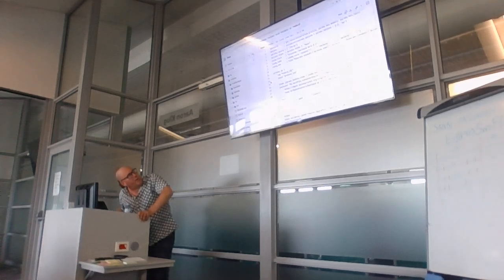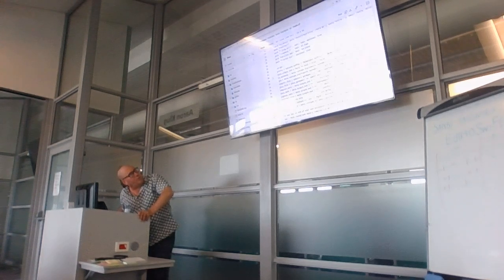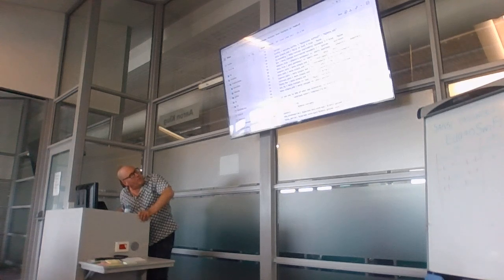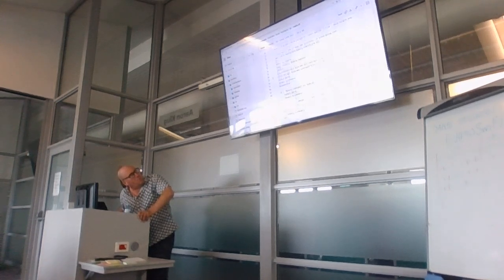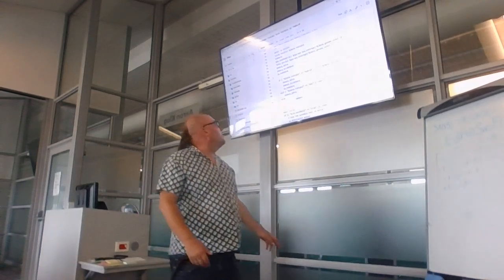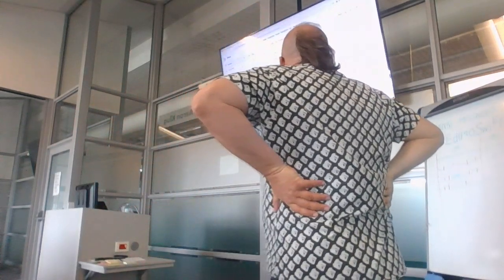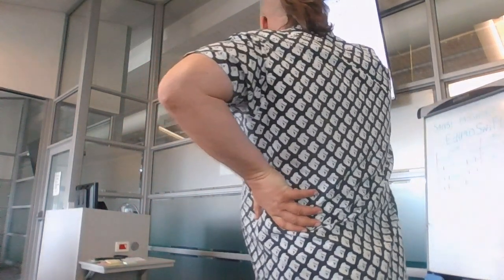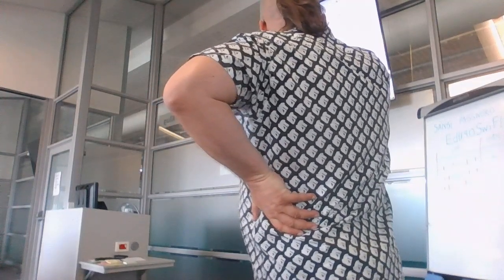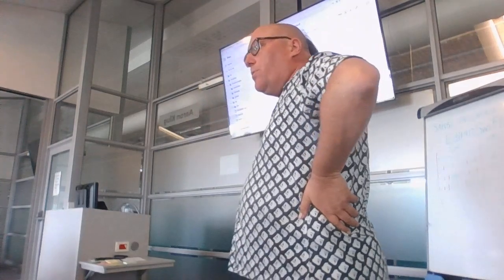So this one is more complicated to read. Process, a whole lot of inputs and outputs, and here's a script, okay? Lots of stuff, more lots of stuff. And then we start seeing code. Line 60. This is shell code. If the run type is hybrid or the run type is short polish, then enable line 61, ONT, and enable Illumina. So enable both. Okay?